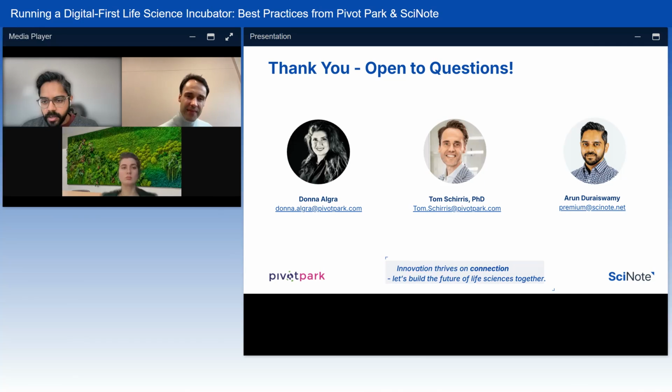Okay, next question. I think this one might be aimed more towards you, Tom, and Donna. The question is, how do you manage space and equipment between labs that work with infectious agents versus labs that require a strict microbe-free environment? I think, Tom, as our lab manager, this question is best suited for you. Yeah, I'm happy to do so.